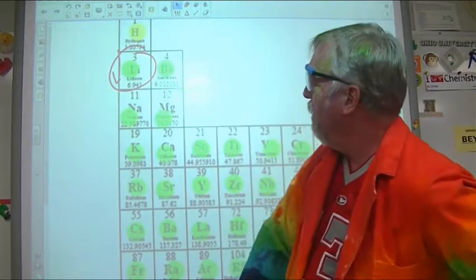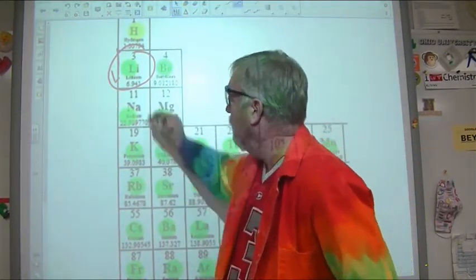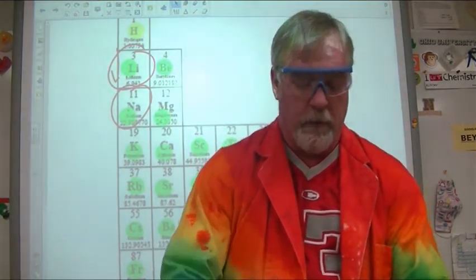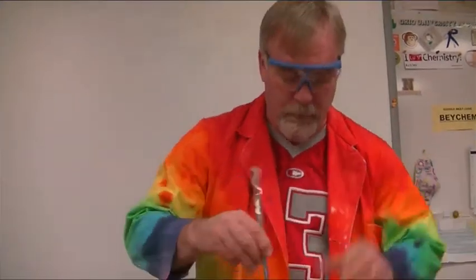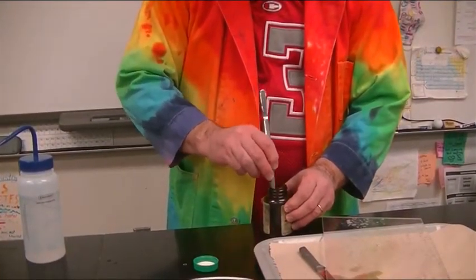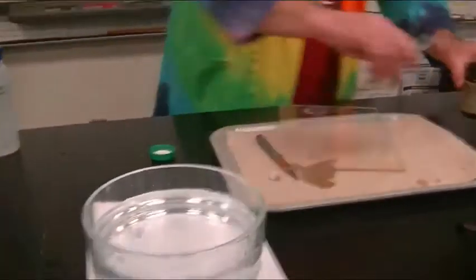As you look down in your periodic table, after we have lithium, the next one down here is sodium. We're going to do sodium now. And we'll show you how we're going to take a little piece of this out, just like Mrs. Bay did. Should be a little saucier this time. A few more electrons there to play with.